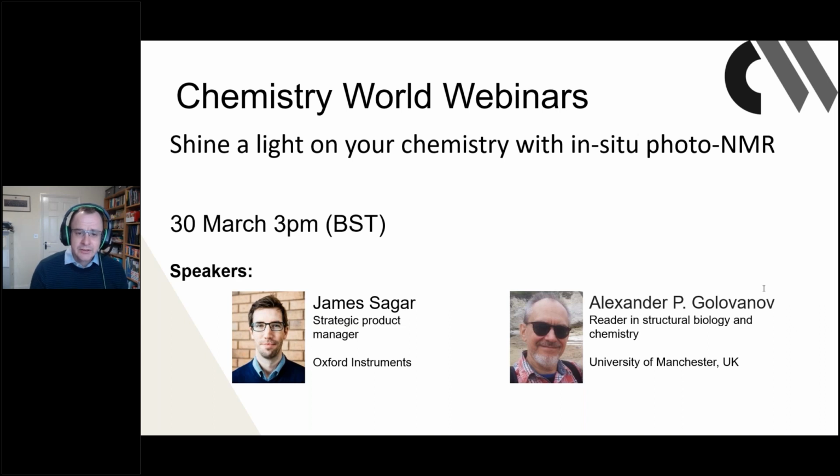So today's webinar is about combining benchtop NMR, nuclear magnetic resonance spectroscopy, with direct illumination of the samples to study photochemical processes in real time. Light-activated reactions and catalysts are increasingly important in research and industrial chemistry, but using them effectively means that we need to be able to understand exactly how those processes work. That means being able to monitor reactions while they're actually going on is really important, and NMR is a great tool for doing that, getting that kind of structural information.